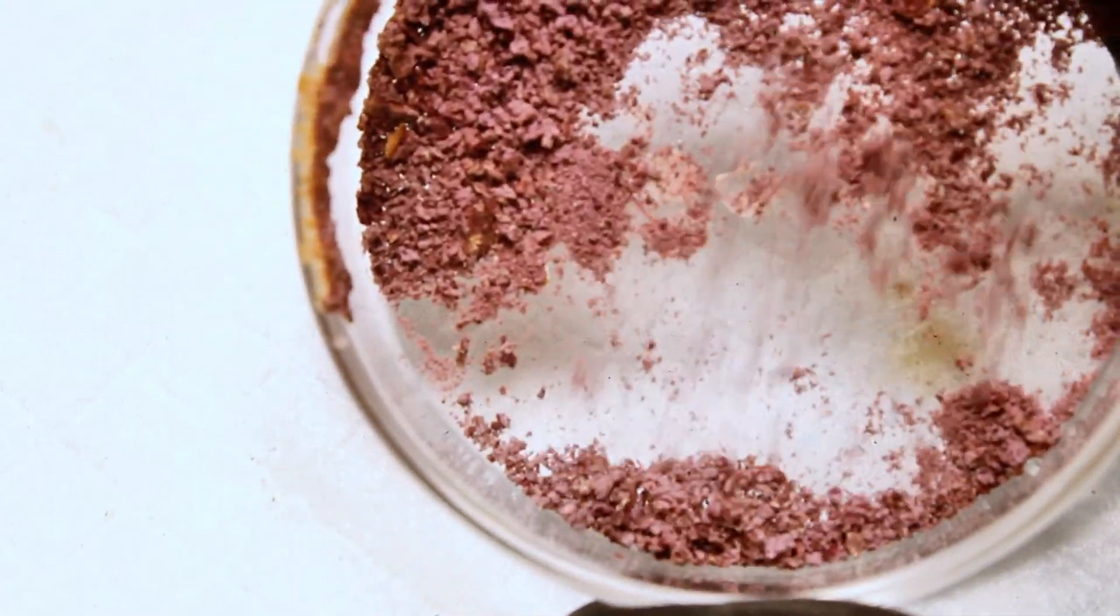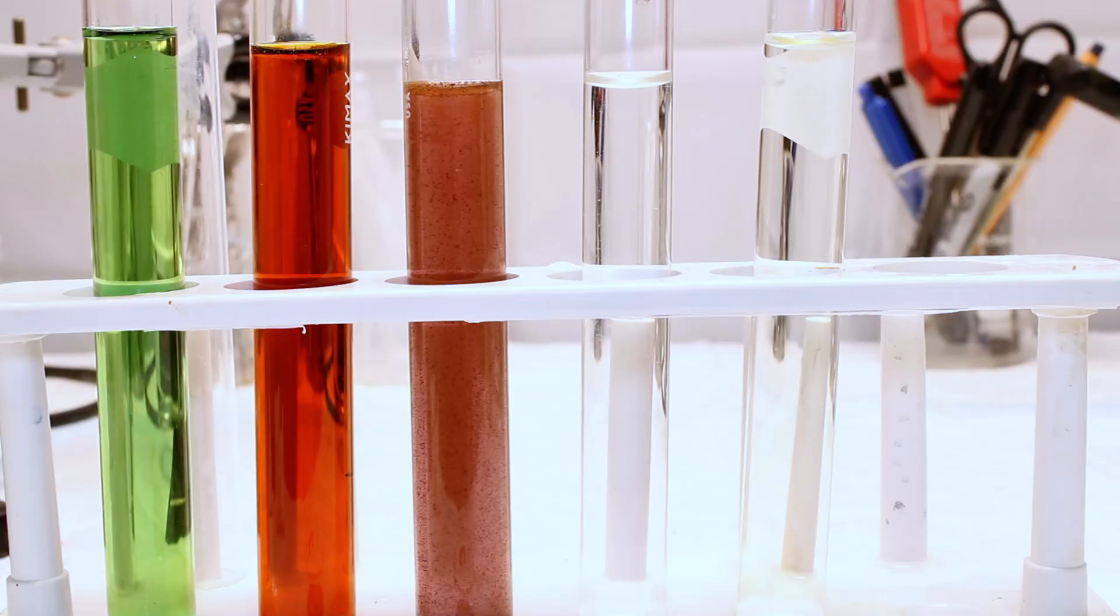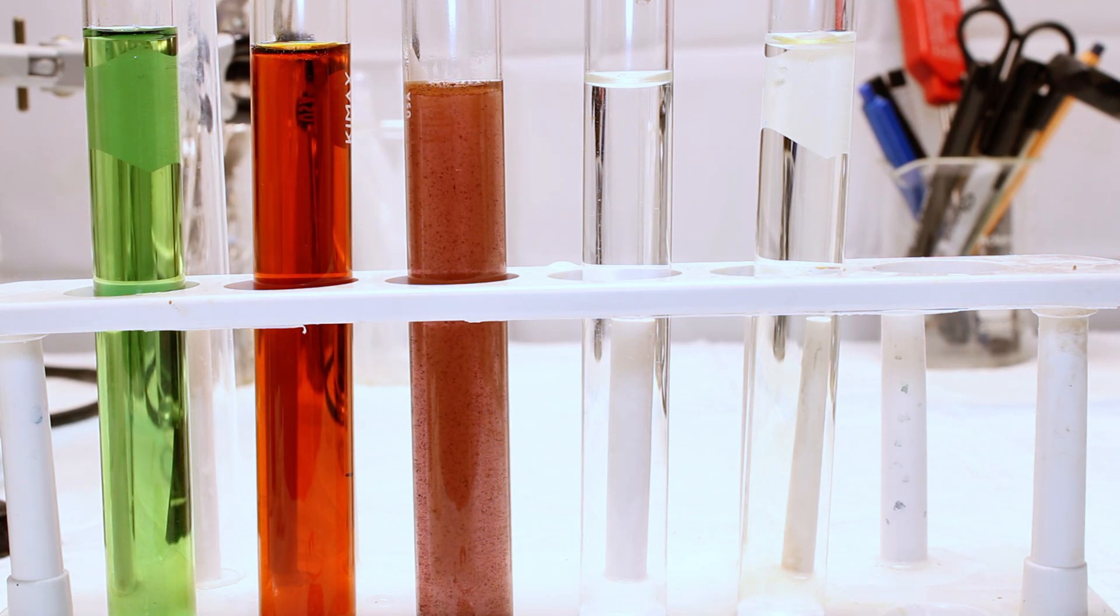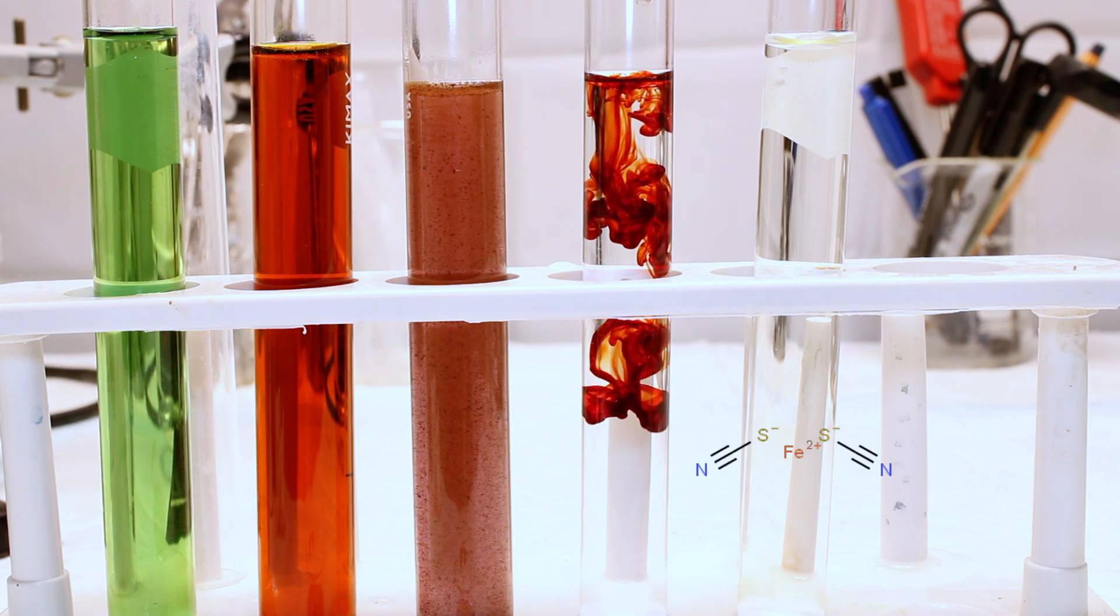For the first one, the addition of iron(III) chloride, or any iron(III) salt, to a solution of potassium thiocyanate will form a blood red complex, which makes sense considering your blood gets its color from an iron complex.